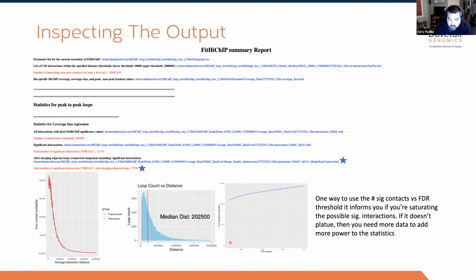Oh, no, sorry, it's back here. This is our cutoff. So it's telling us the number of loops that happen at our predefined cutoff. Now, if we wanted to relax what that threshold is, so it started at 0.01, we could take this all the way up to 0.1.